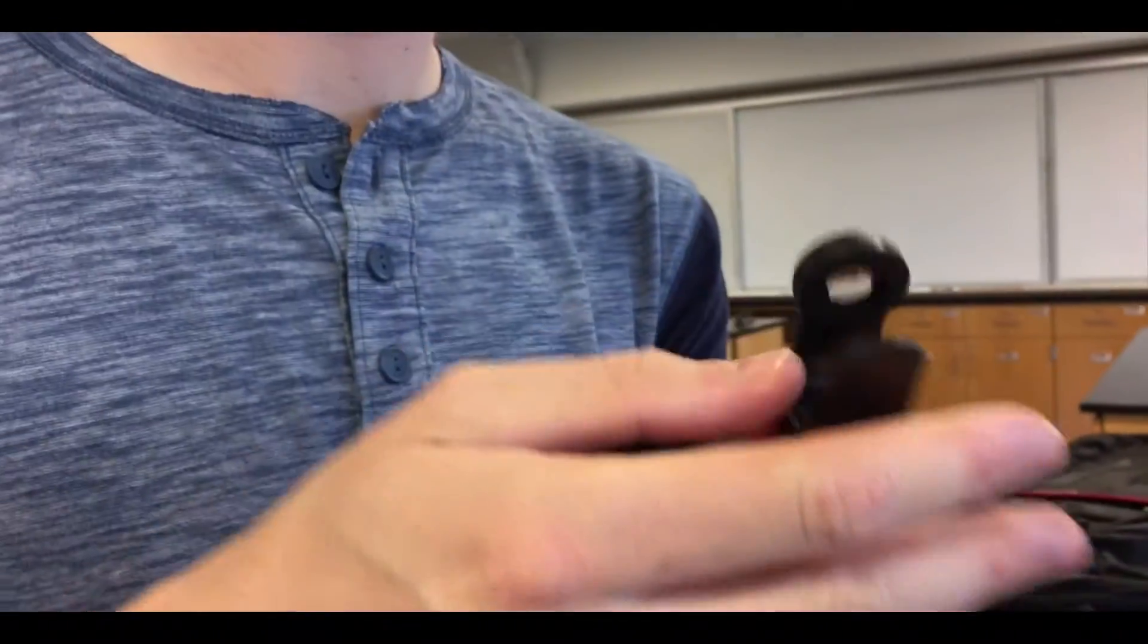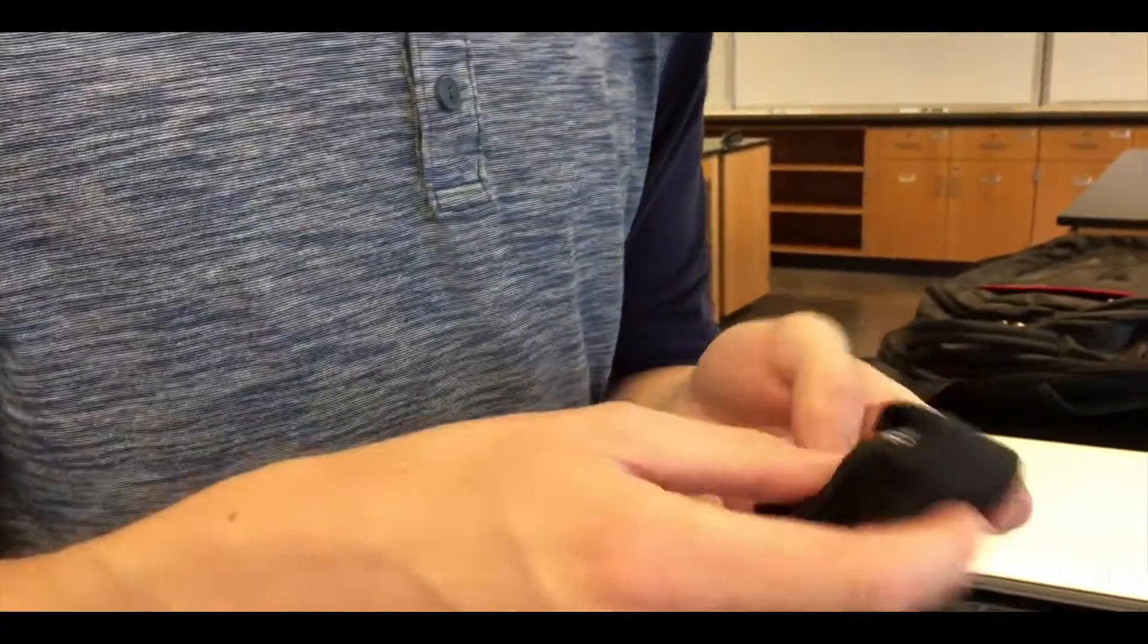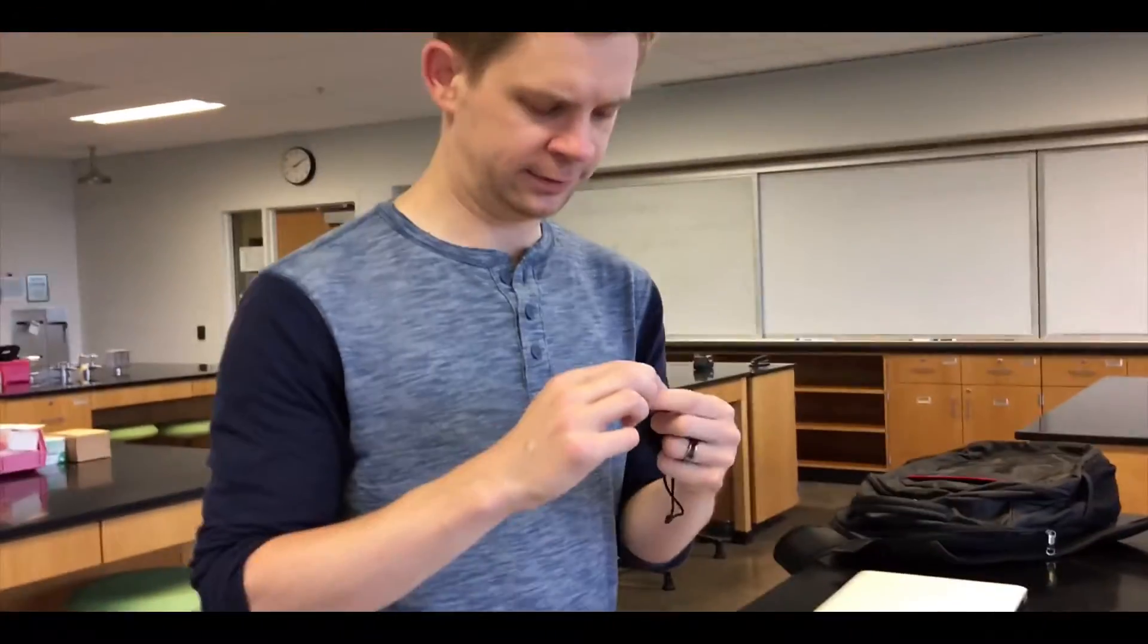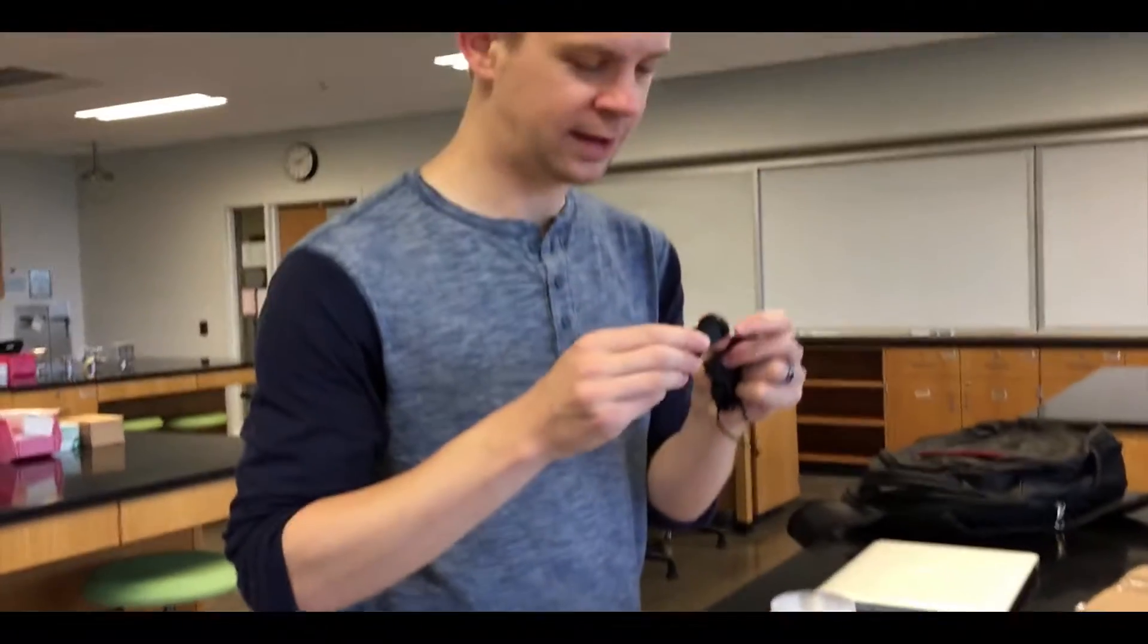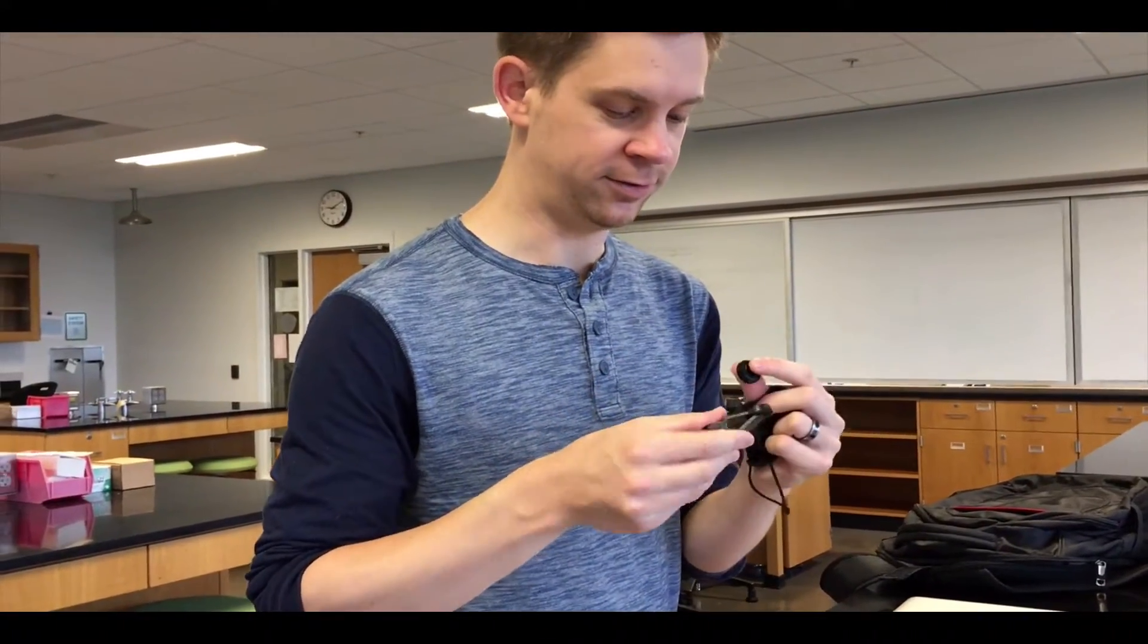Magnifying glass, yep. I wonder if that clips on your phone. I would guess it does. And this is, this should turn a phone into like a microscope for this. That is very cool.